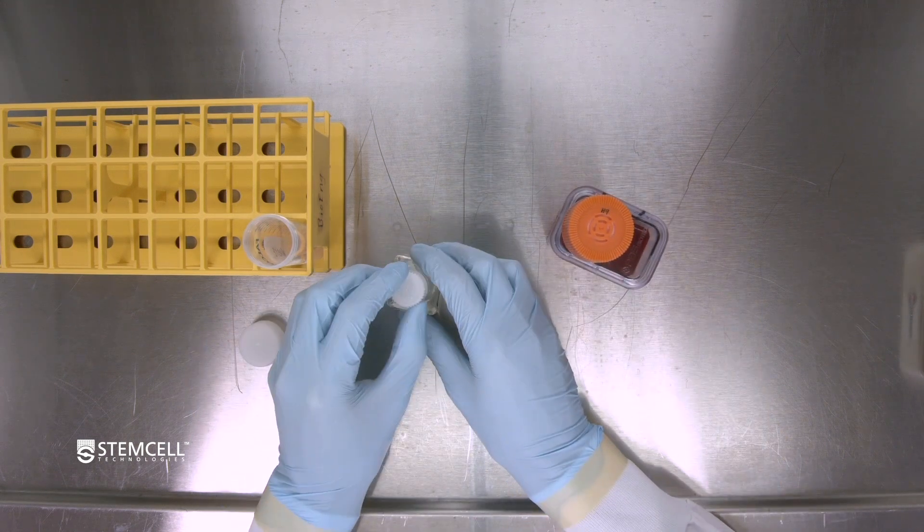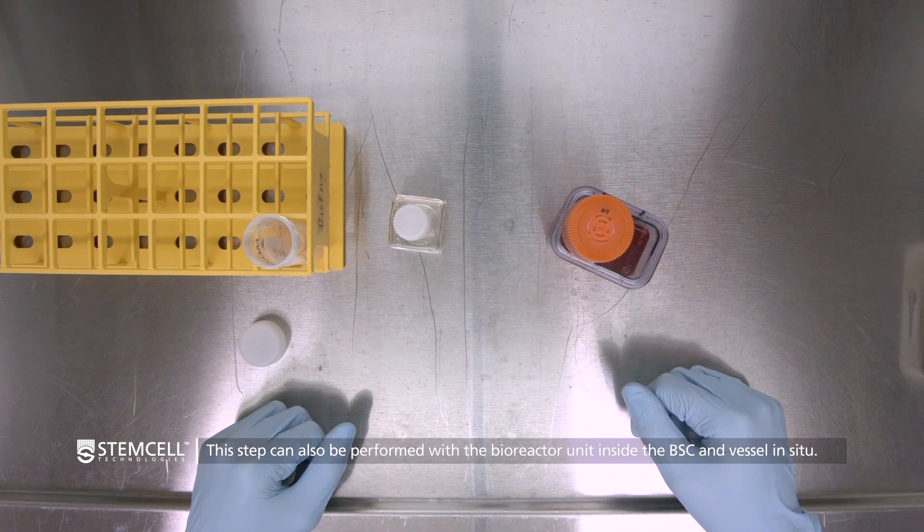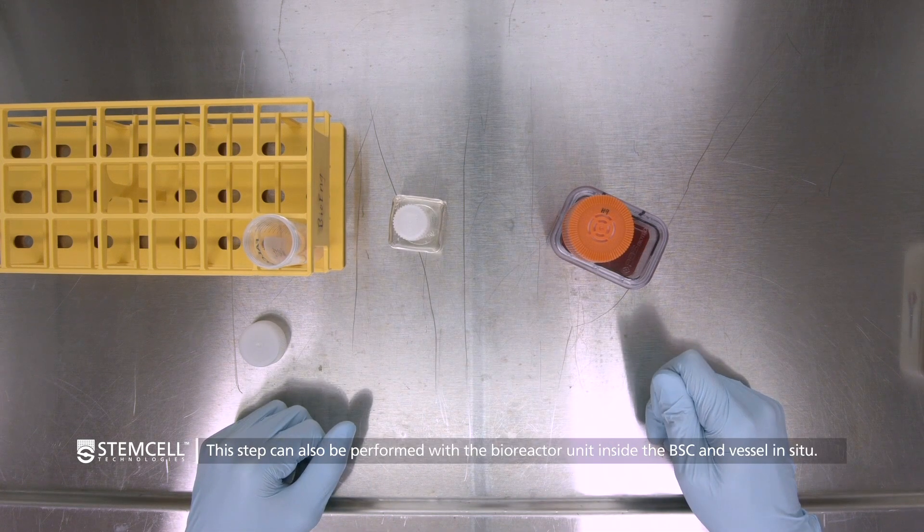When the feed has been added, return the cap to the bioreactor and return the bioreactor to the housing unit inside the incubator.